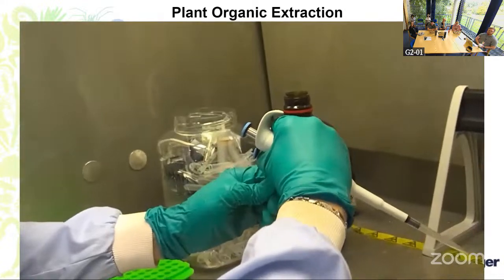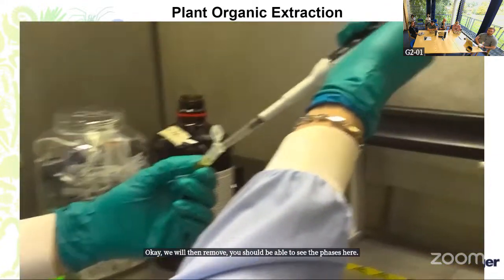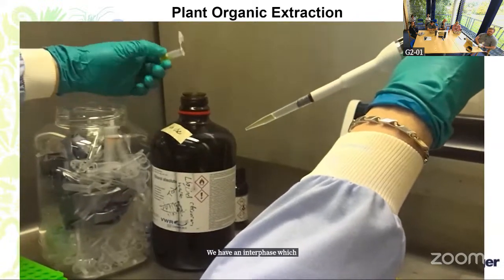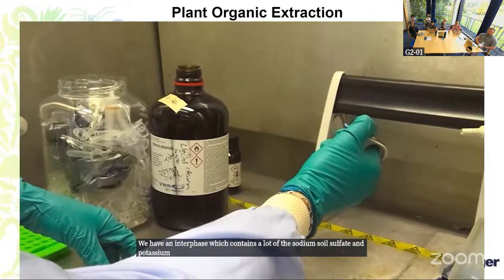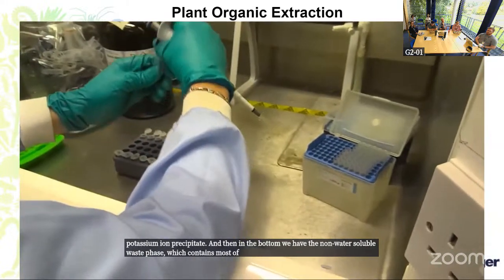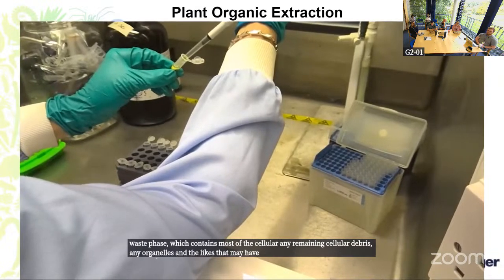Okay, we will then remove, you should be able to see the phases here. On the top, we have the aqueous phase, which contains the high molecular weight gDNA. We have an interphase, which contains a lot of the sodium dodecyl sulfate and potassium ion precipitate. And then at the bottom, we have the non-water soluble or waste phase, which contains most of the remaining cellular debris, any organelles and the likes that may have been carried over previously.